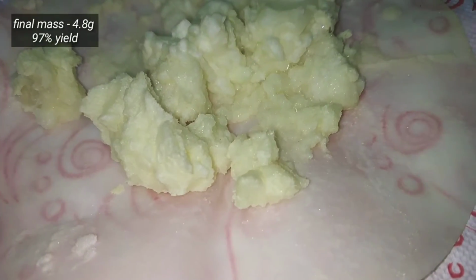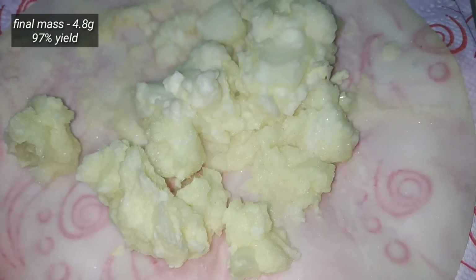Here is the purified Benzil. We should not be doing this drying process under the sun as Benzil will decompose under UV light.